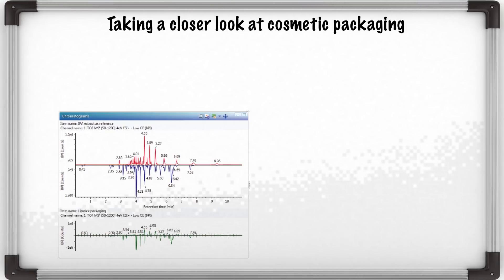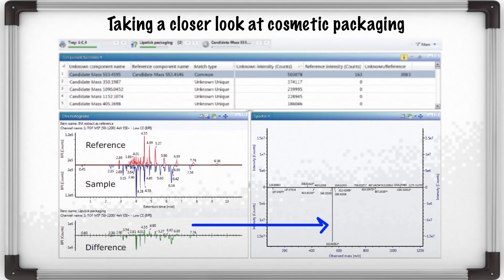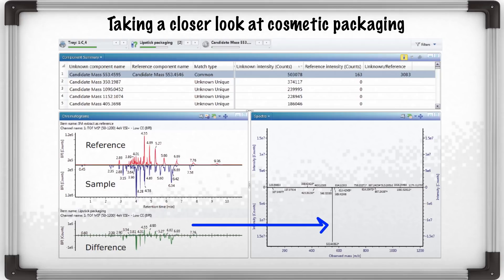You look at the bottom left of your image, the reference which is the red trace and your sample which is the blue trace, and the green is the difference in between the two traces which is basically indicating all those that are present in your blank has been removed from your sample and only the peaks of interest that might be of cause of concern. And when you double click on the green trace at the retention time of 3.8 minutes, it actually pulls out a mass spectral information and with the help of UniFi SPDR database search, you will be able to confidently identify the peak of interest.